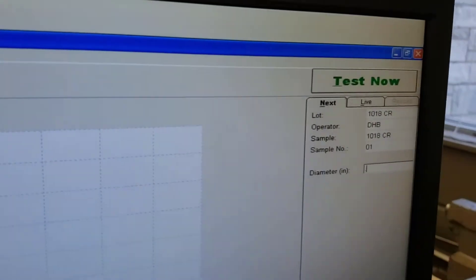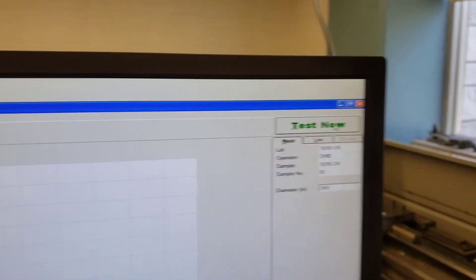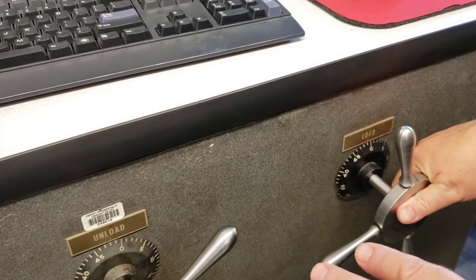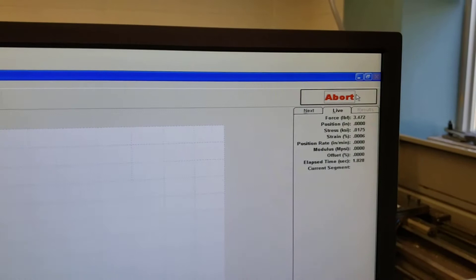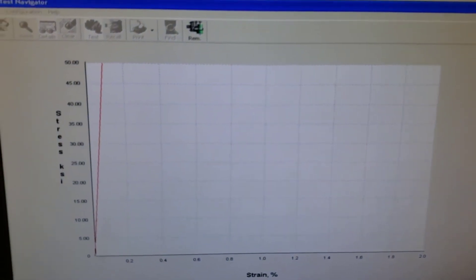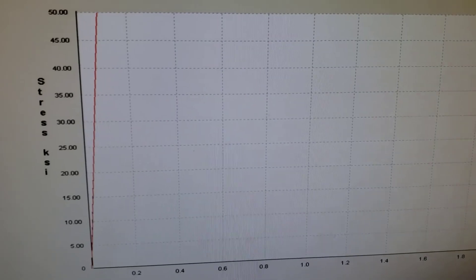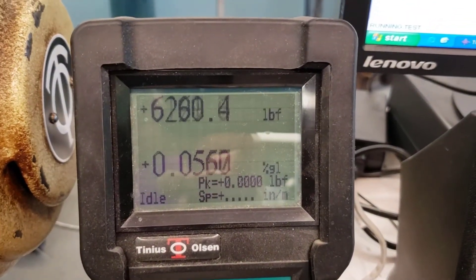When we're ready to test, I click 'Test Now' and turn on the captain's wheel, going up to about 6 or 7 — maybe as high as 10 to take up the load. I can pre-turn it on because there's slack in the system, then hit 'Test Now.' Nothing happens at first because the load isn't taken up yet. Very quickly you see 600, 700, 800 pounds. Take a look at the computer screen — that red line is the modulus of elasticity and will fall over as we continue to pull. The black line underneath is the strain reading, which we can see on our monitor: 0.04, 0.05.